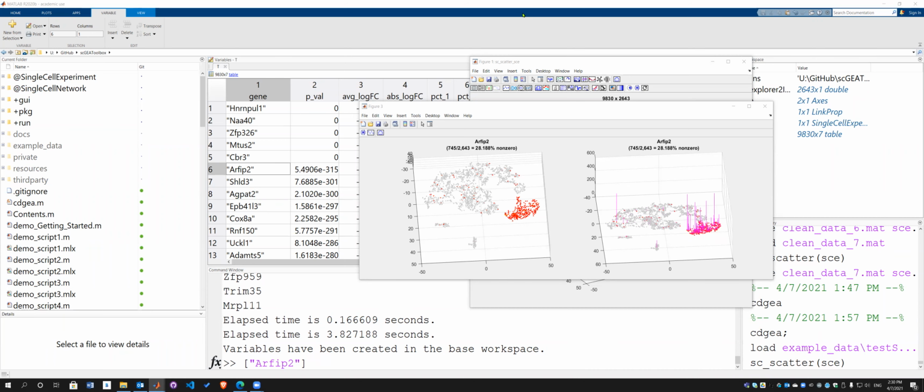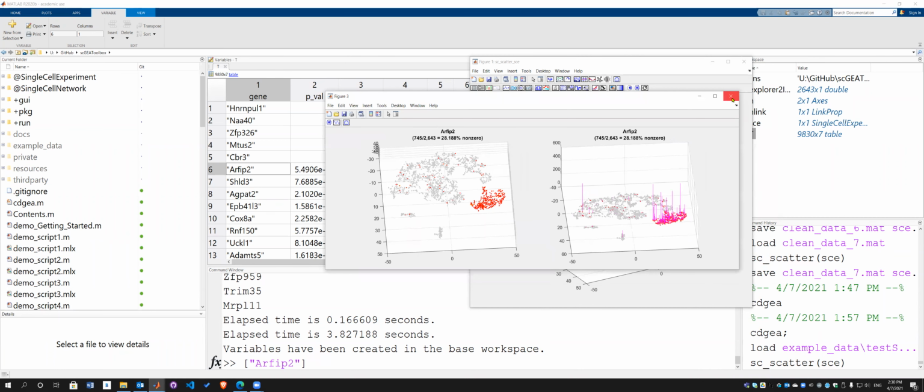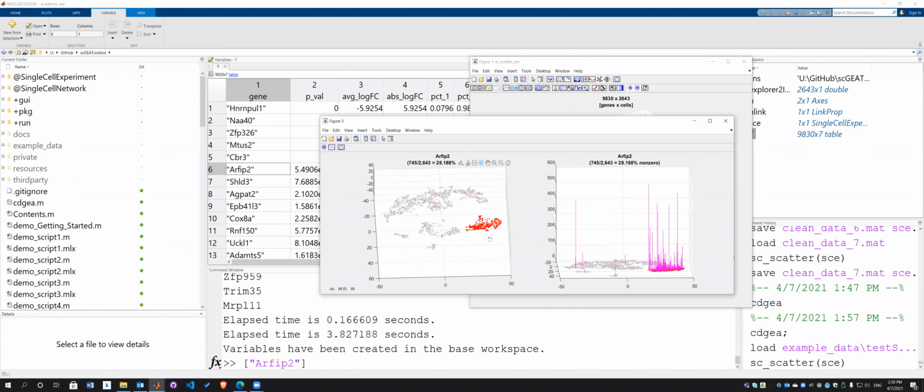I have a quick question. With looking up what the individual genes do, like the ARFIP2 gene, would looking up what that does in comparison to other ones help with our analysis at all? Or is just knowing the cell type and relationships and prevalence all good?